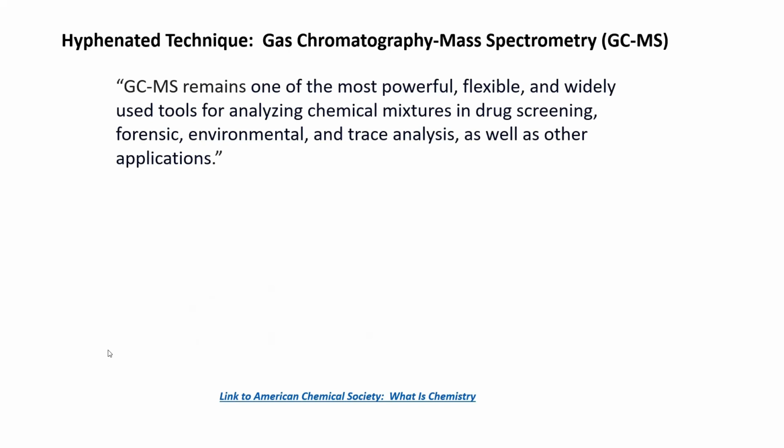Gas chromatography mass spectrometry is a hyphenated technique. GCMS remains one of the most powerful, flexible, and widely used tools for analyzing chemical mixtures in drug screening, forensic, environmental, and trace analysis, as well as other applications.